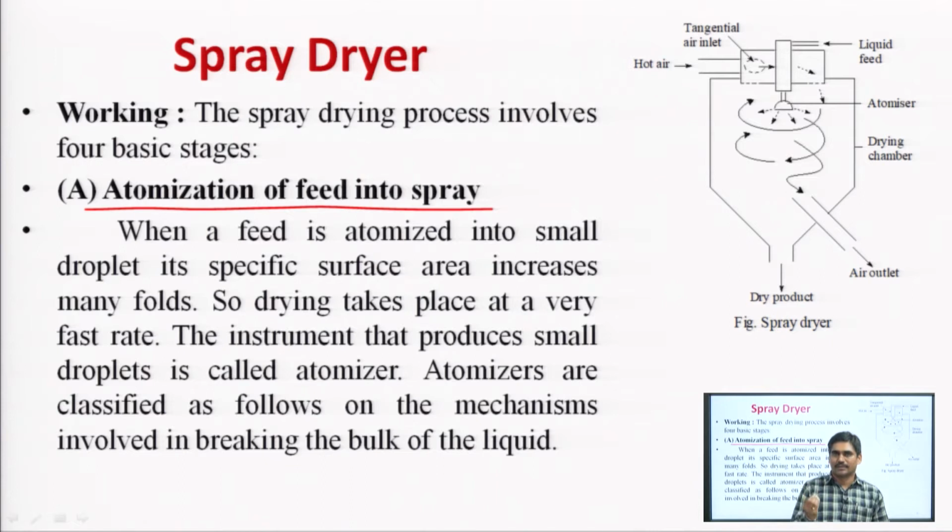Due to this, drying takes place at a very fast rate. The instrument that produces small droplets is called an atomizer.